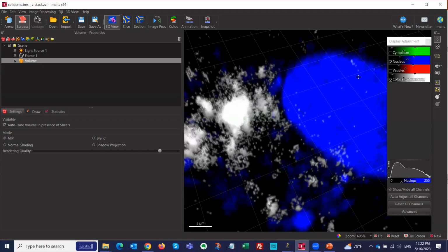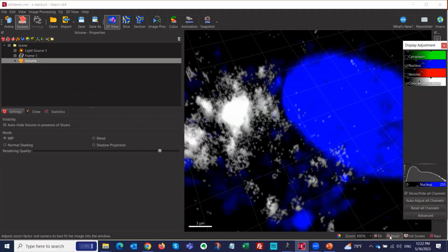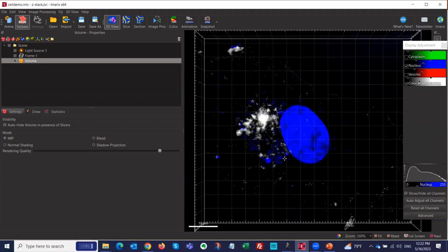But you could also do masking. Okay, I did not talk about masking yet, but masking is a pretty powerful tool in Imaris. So I did want to touch on masking now real quick before we jump into the filament trace. Probably is the last thing today, so I can give you 5 or 10 minutes for questions at the end. So I could use this new channel here to mask into the blue channel, for example.